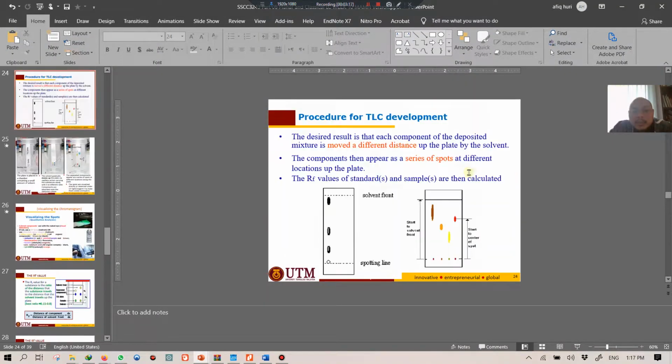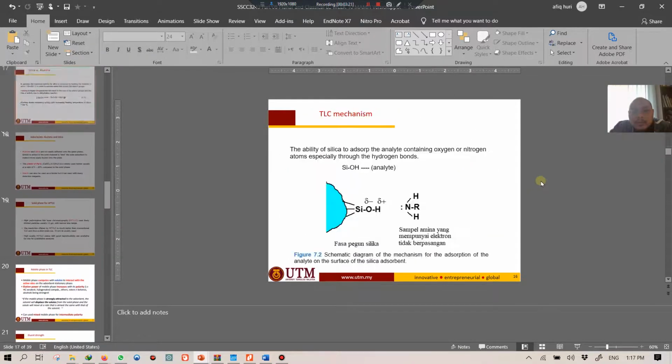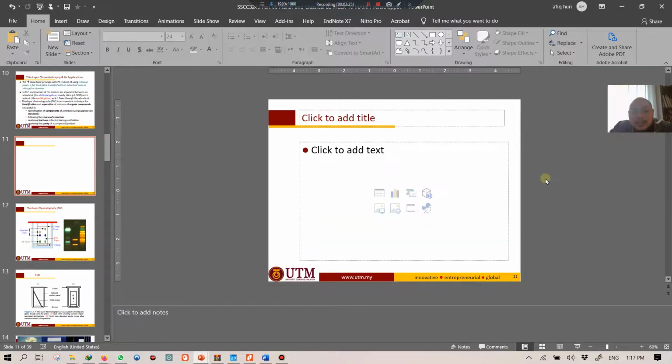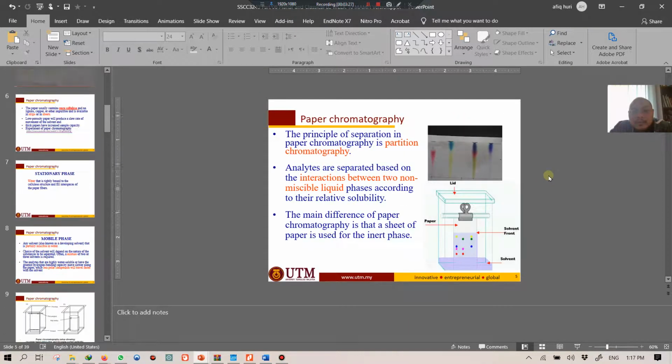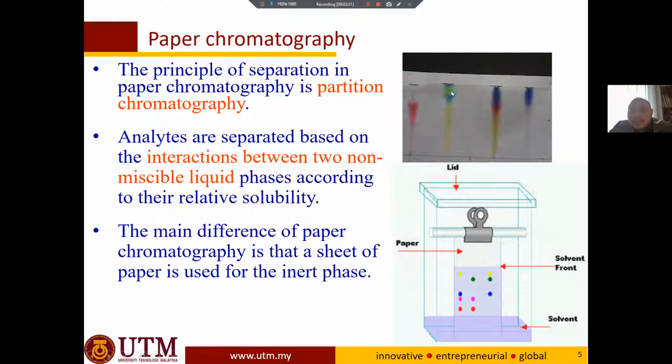at the figure of the paper chromatography, do we have? Alright. Oh dear, I don't show you. Hopefully I have. No, I don't. Okay. Here, okay. The paper chromatography, it's not forming a very good spot. So it just gives you a band, or band of color.